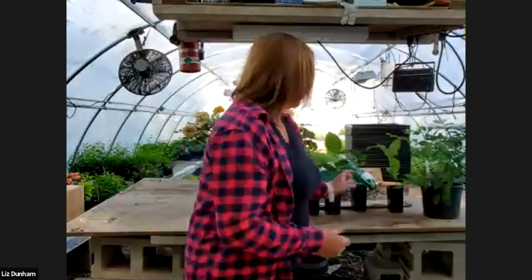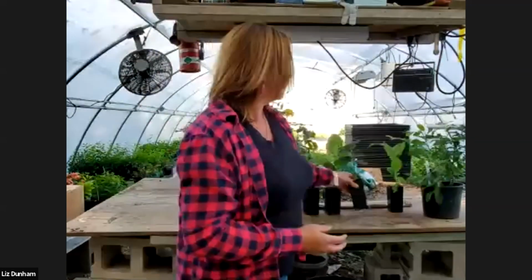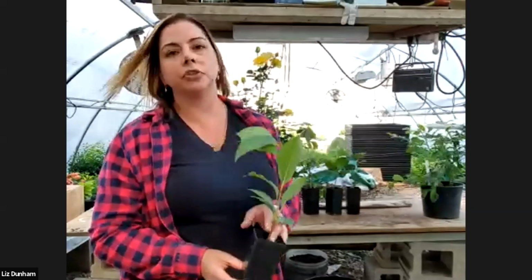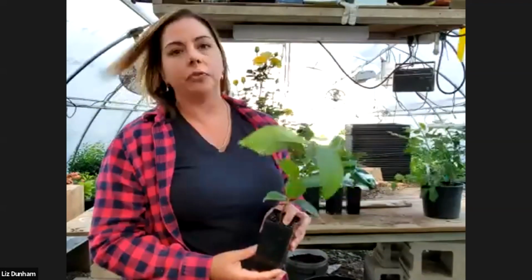This is Venus, the older variety of dogwood. Nice big leaves. We do a fair amount of Amelanchier as liners, and they go to our customer, St. Lawrence in New York. So this is Amelanchier season. We do a lot of Amelanchier. It's another one of those things that most tissue labs do. This is Halesia monticola rosea. It's a beautiful tree.